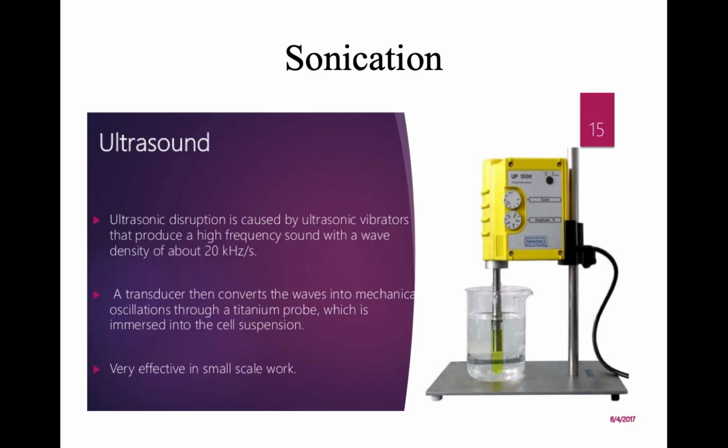At the same time, we can also use one more method called sonication. This method is suitable for suspensions of cells or microbial cells, and the cells are exposed to ultrasound of around 20 kilohertz for 30 to 60 seconds. In this case also the cells are disrupted by the shear force, and it creates cavitation. With the help of the cavitation, the cells are lysed.